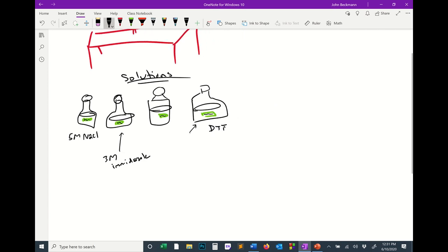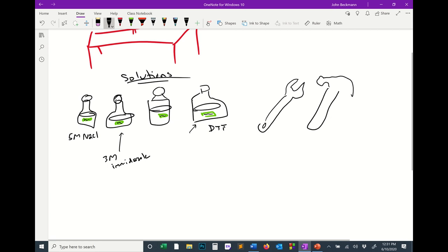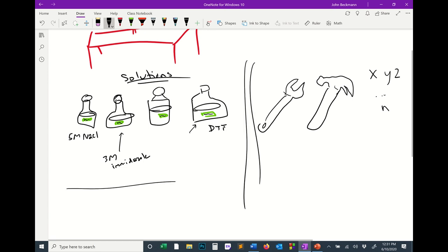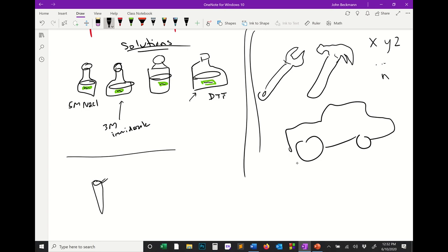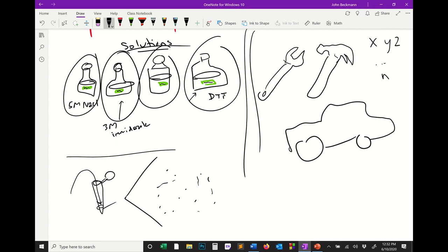You could imagine if a mechanic went into a mechanic shop and there was a wrench and a hammer, and each of these tools X, Y, Z, so on up to N, all these tools have a different function. Now in the wet lab, our buffers, our solutions, are essentially like our tools. They are our toolkit. And instead of working on a car like a mechanic would, we are working in the lab by mixing in little tiny tubes, little tiny volumes of liquids. And in those liquids, there's little chemicals that are doing certain things, doing certain reactions. And so each of these different solutions is a tool within that environment.